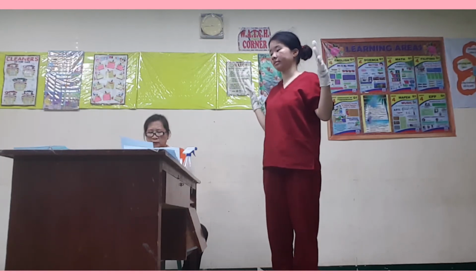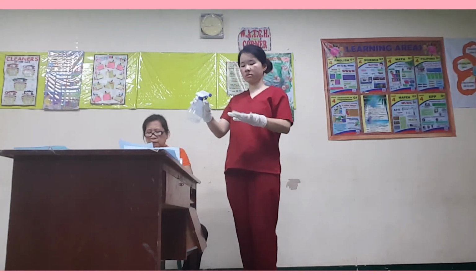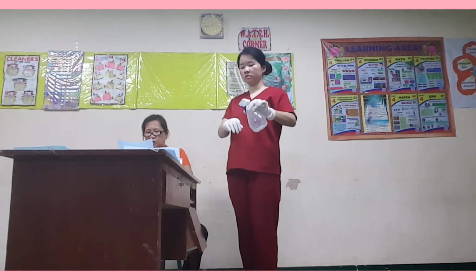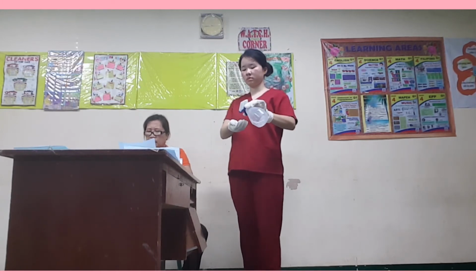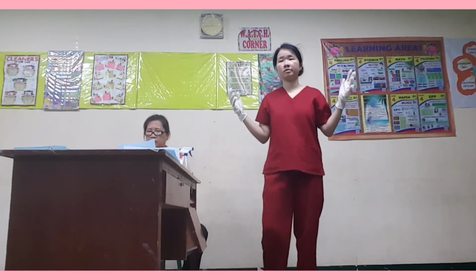Procedure number 18. Disinfect gloves. Use 1:10 bleach disinfectant or alcohol-based hand rub (ABHR) to reduce and prevent the transmission of microorganisms among the healthcare personnel.